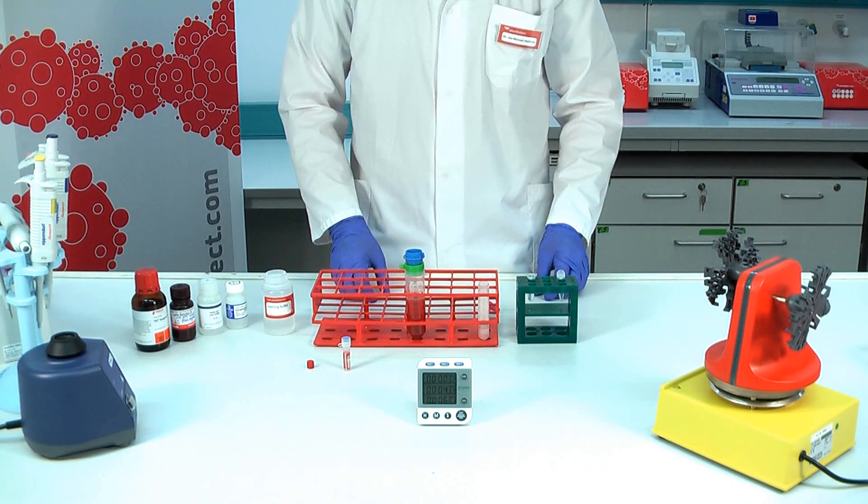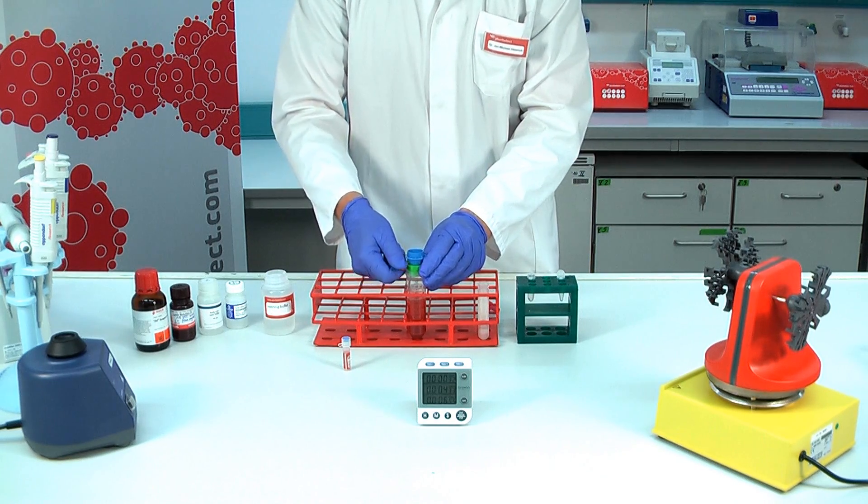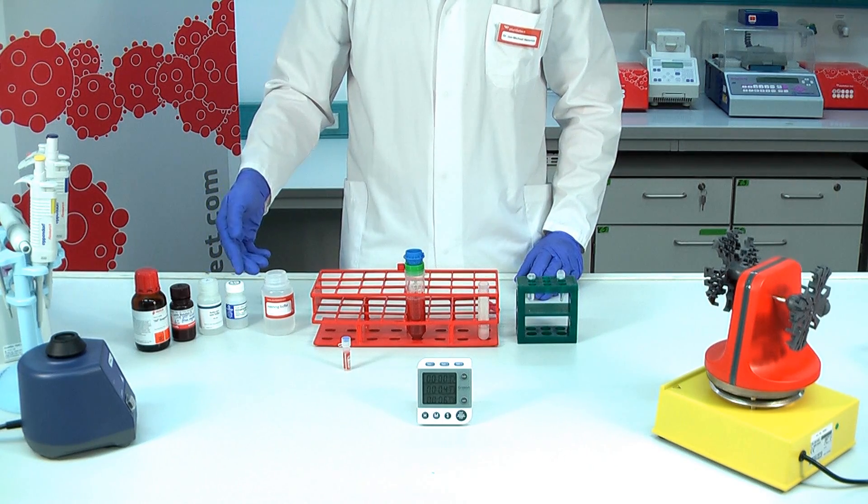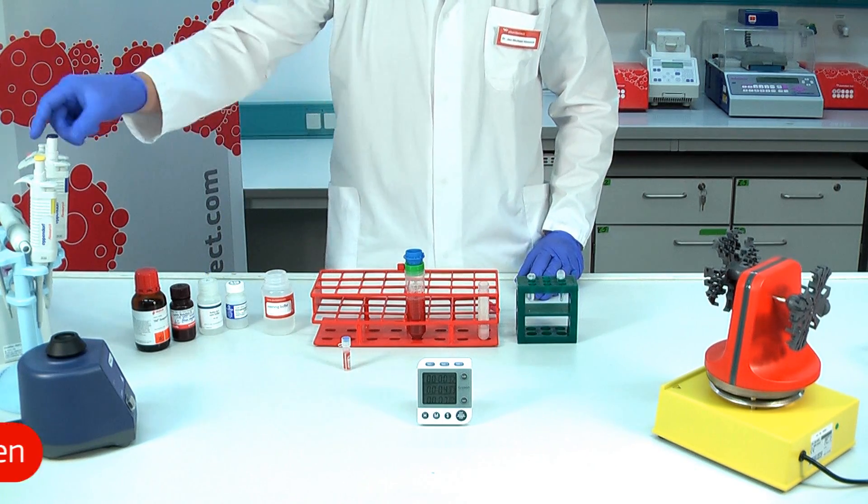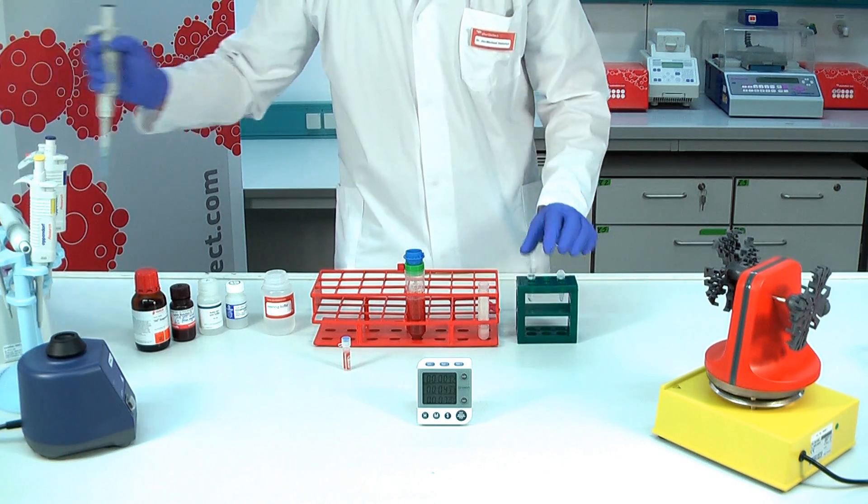After washing, close the luer lock. Here you can see four different buffers for lysing cells. For the presentation we choose the RLT buffer from QIAGEN, which already has been prepared in a small tube.